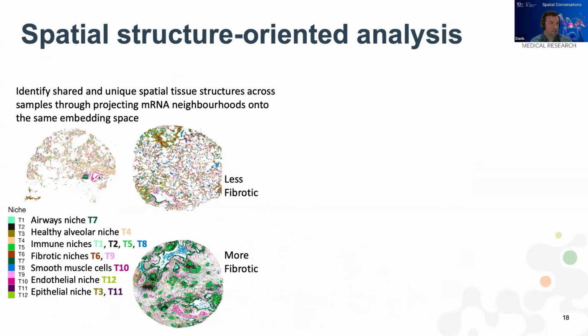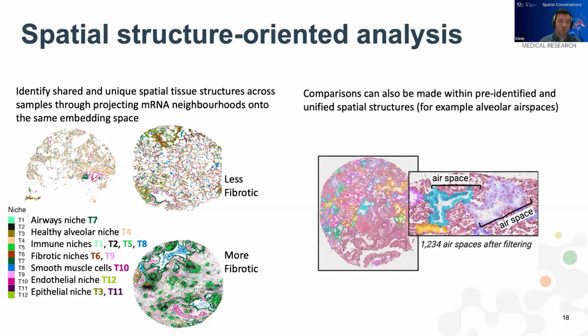So, as I said, the GraphSage approach gives us a new embedding space, a new representation of these transcripts that lets us make comparisons in hopefully a sensible way between these very structurally and molecularly different samples at large scale. We might think about other ways that we can find those comparable structures that allow us to make robust comparisons between very different samples. And so the next step for us was to look directly at the air spaces, which of course are relevant for the lung.